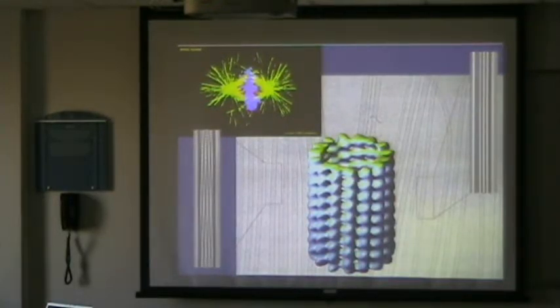These are microtubules like we encounter them in an in vitro approach. Typically in vivo, you have that type here, which is a 13 protofilament microtubule. Very straight protofilaments, basically no super twist. That's the typical, I would say 80 to 90% of your microtubules in your body are actually of that type. Now for helical reconstruction, these are not usable. They have a lattice problem, which you cannot use for helical reconstruction. That's why we always used these 15s.